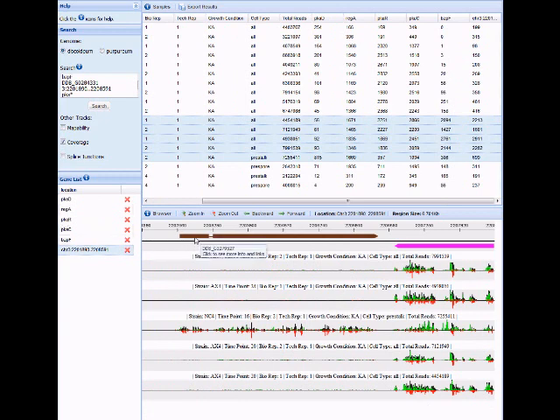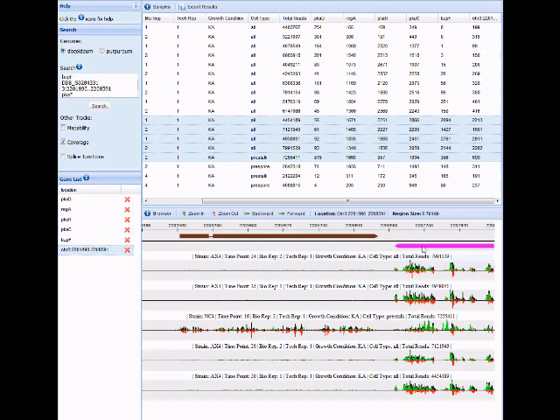If you mouse over a gene model, you can see the gene name, and you can click the gene to get external links like DICTYBASE and DICTYEXPRESS.